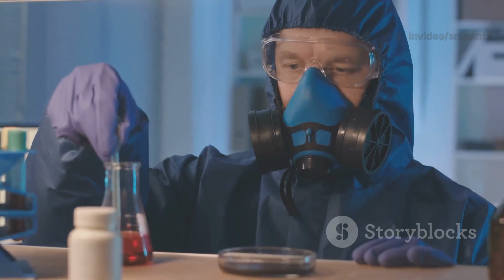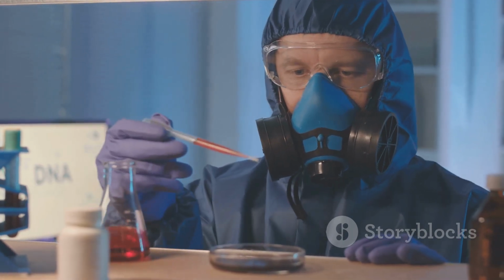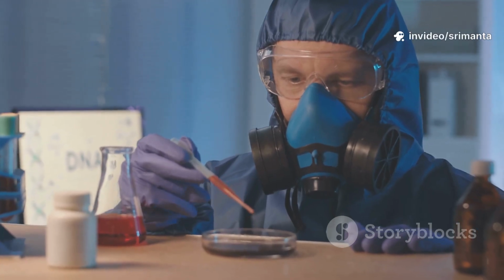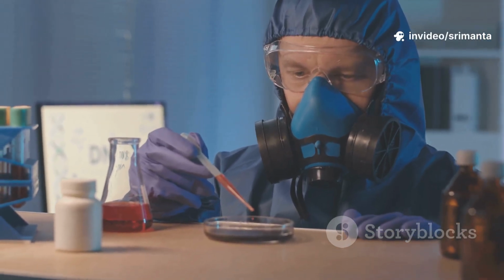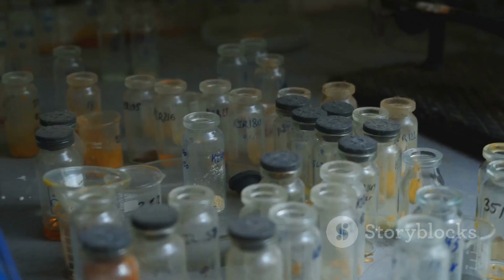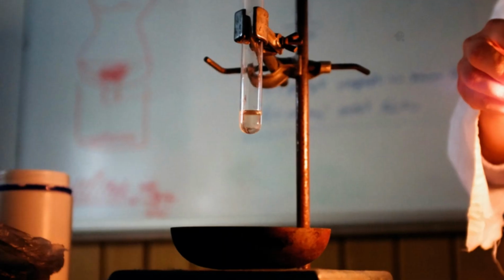This cotton has a very important job. Sometimes, other gases can be produced during the reaction, like hydrogen sulfide, which could interfere with our test. The lead acetate cotton acts as a filter, trapping these interfering gases and letting only the arsine and hydrogen pass through. At the very top of this glass tube, we get to the most critical part, the detector.